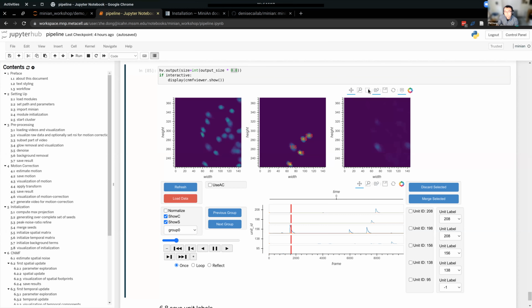One quick thing, since we're on this: there's a box select tool here. If you click on that, you can make a selection of cells in the left panel. So let's say I want to visualize this one, you can draw it. Give it a few times.